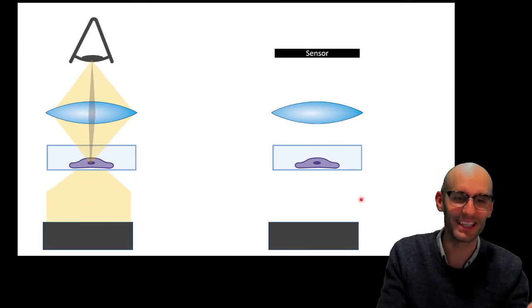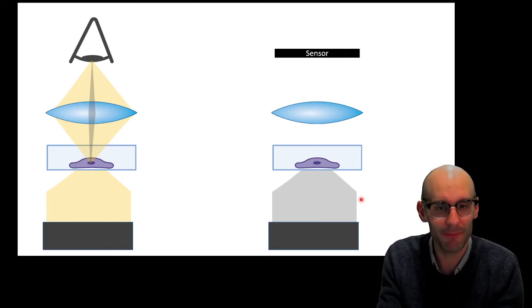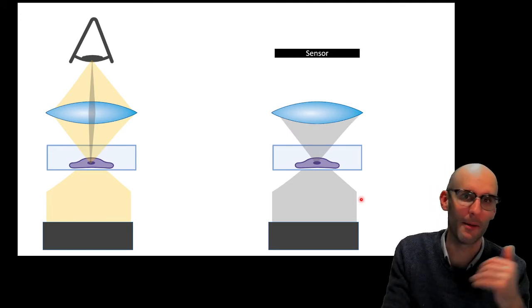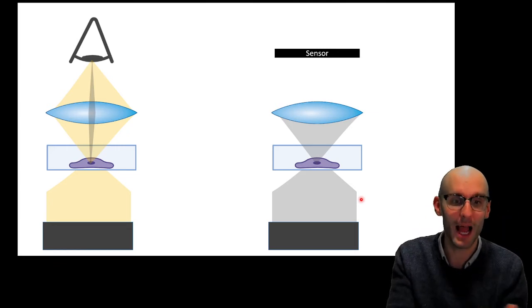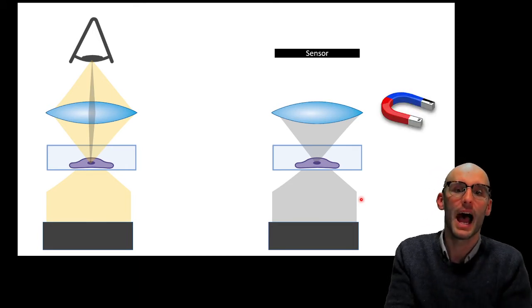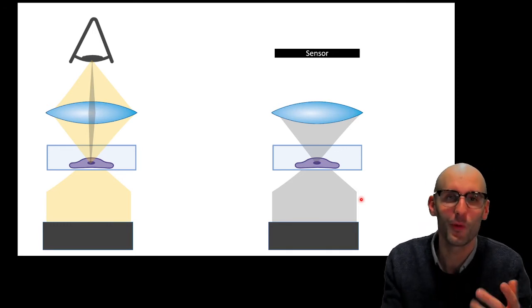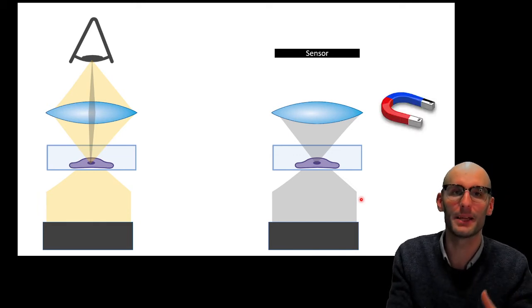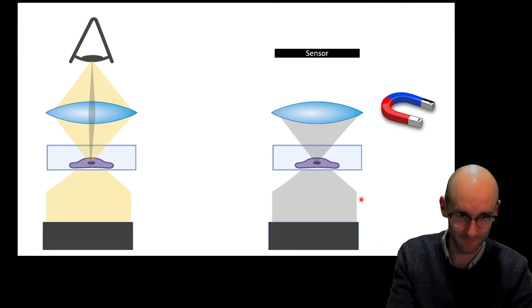So now let's look at the electron microscope. We shoot an electron beam at it. We focus that electron beam. That then interacts and is either scattered or goes straight through the sample that's incredibly thin. We cut the sample incredibly thin. It is then focused by another lens. Now you might go, wait a minute, lenses don't work with electrons, and that's 100% true, but electrons can be manipulated by the electromagnetic spectrum. They're charged, so we can warp them with magnets.